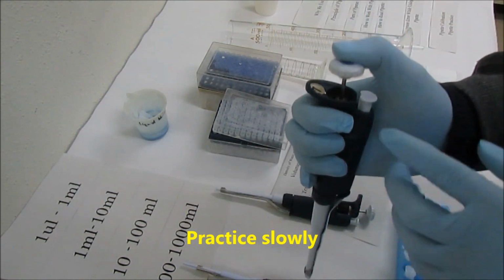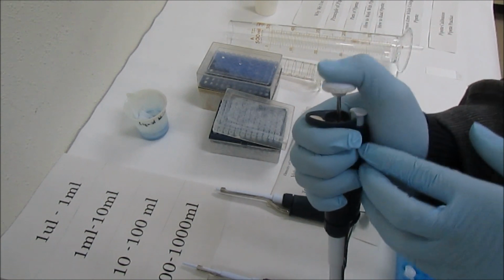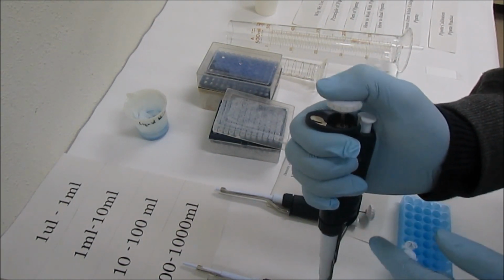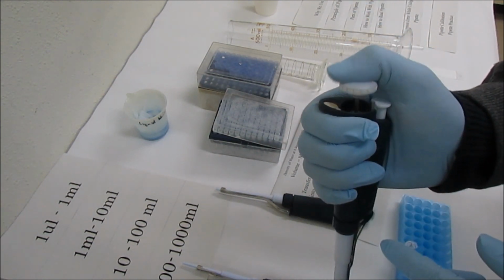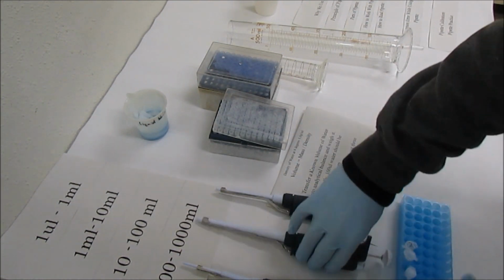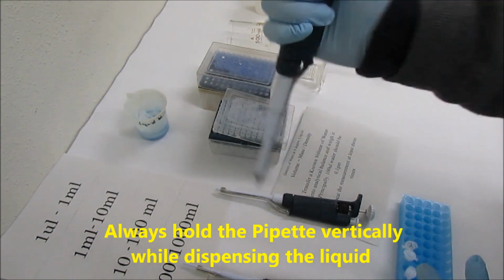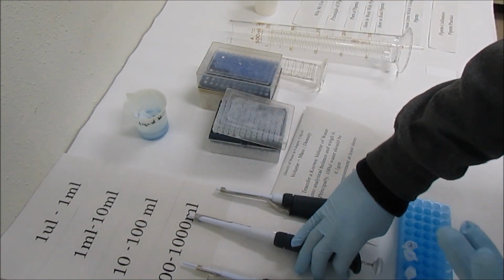If you are a beginner, you have to become aware of how to use it, and get a feel for how much force you need to apply. So practice like 10-20 times, pressing up and down. This is very important. Third, always hold the pipette vertically, not like this, not like this. And the fourth is very important.